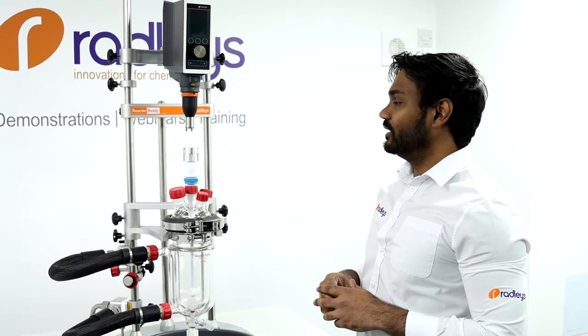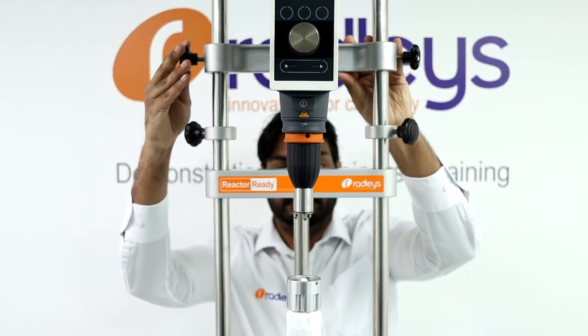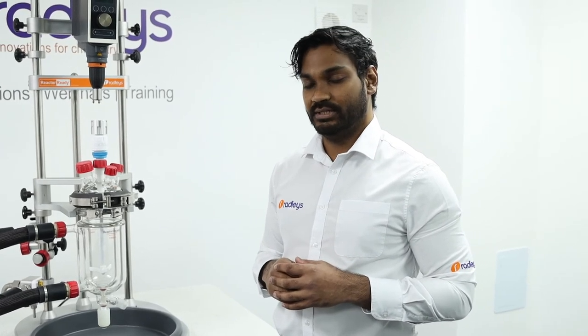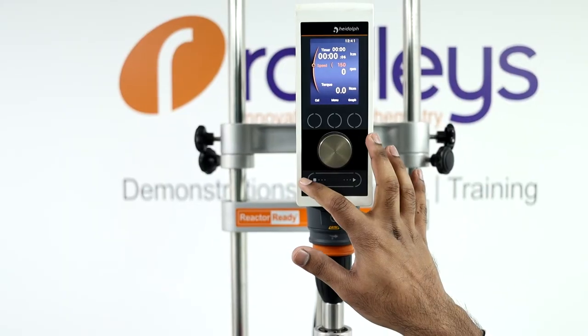You can then use the I-beam to line up your overhead stirrer with the stirrer guide, and then lower your overhead stirrer down until the three pins in the drop-in coupling just engage with the pins in the stirrer guide. These colors will help you locate the overhead stirrer into the right position. Now you can switch your overhead stirrer on and check that your impeller is stirring correctly.